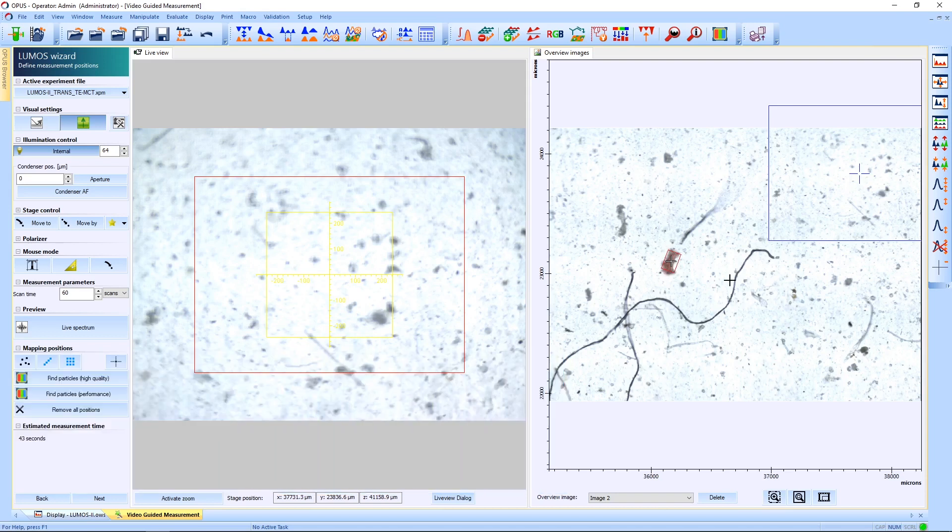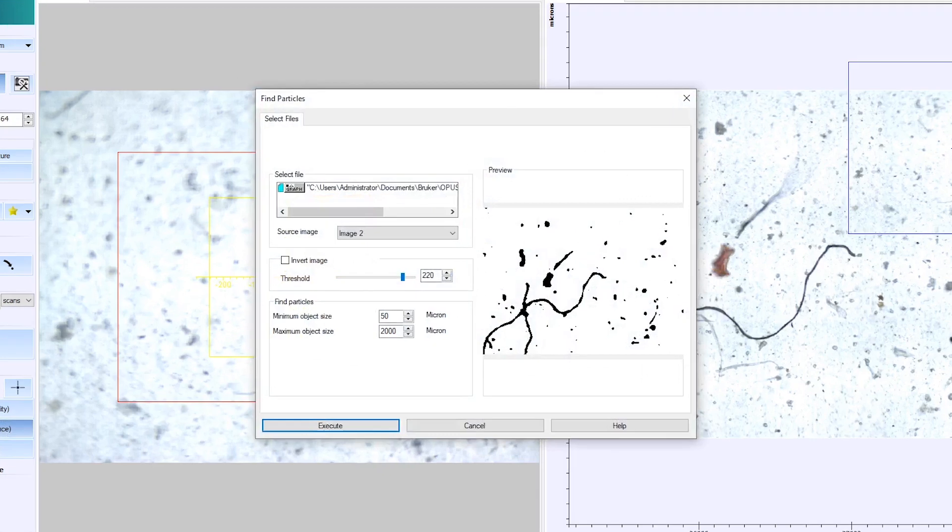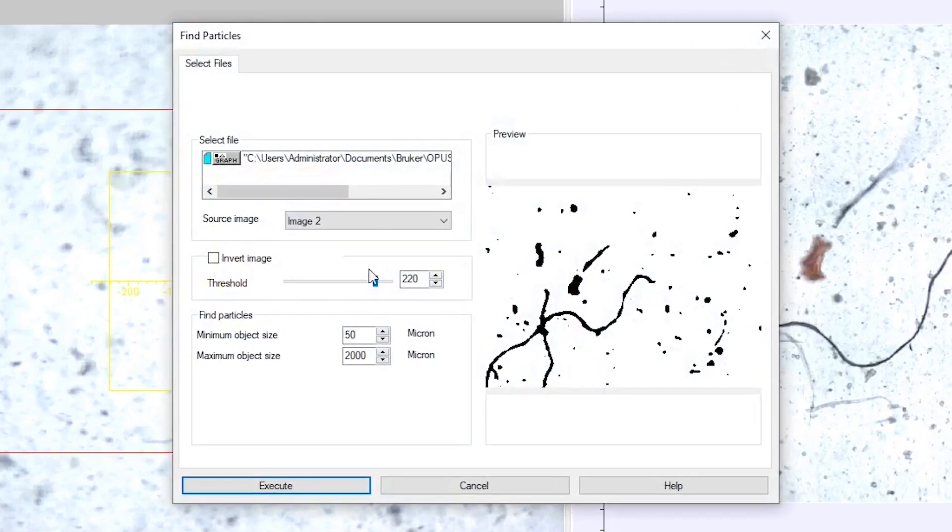But because this is quite time consuming if you would do it for all the particles, we have the Find Particles feature that will find them for you.